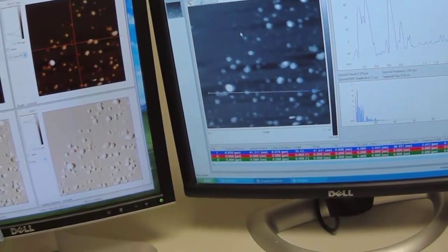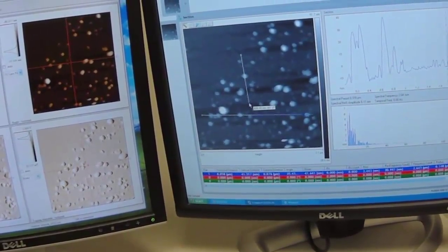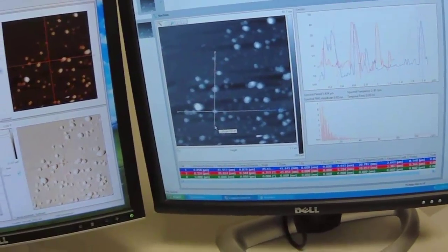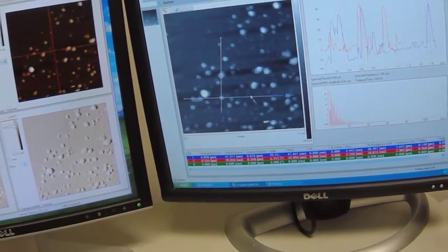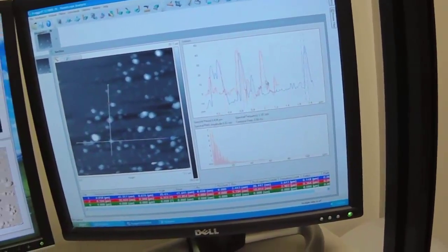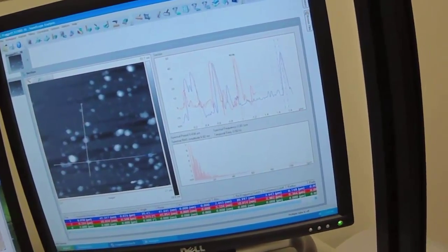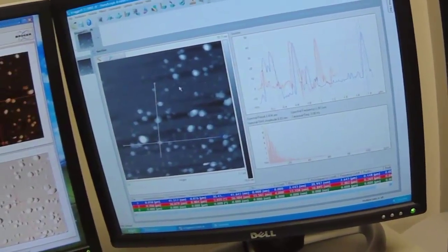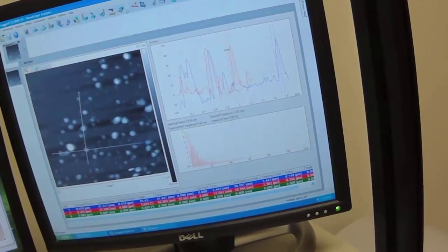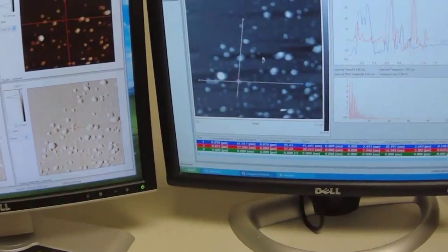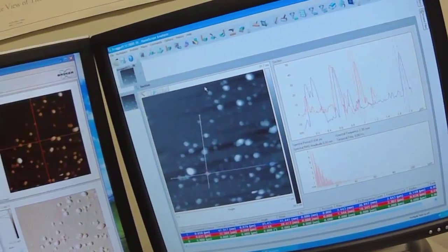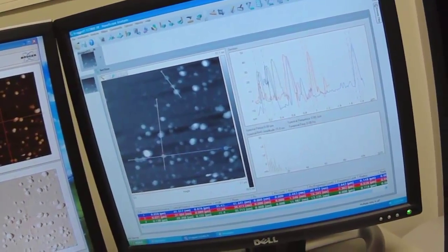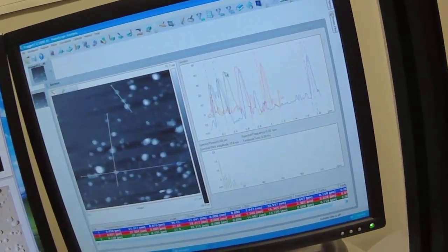If I want to, I can draw another line. So you could measure many at a time. So this is our red line. And you can see it's overlying, but I could do... So you have a lab partner, right? So the two of you could figure out these measurements quicker than I can here. And then you can even do a third line. Let me do the third line here. And you can tell the difference because they have different colors here on this profile.